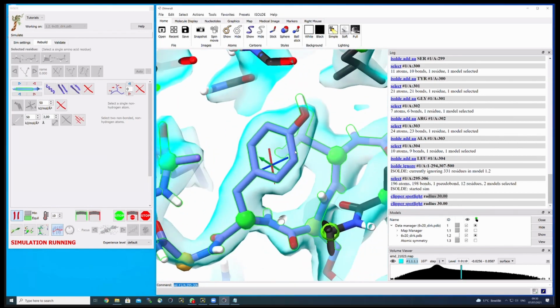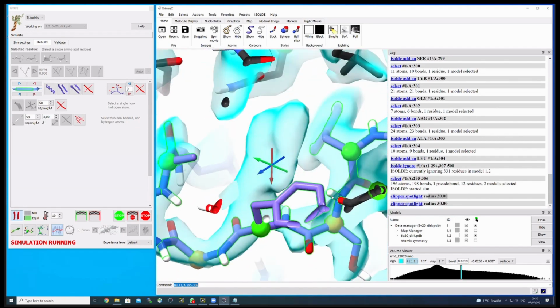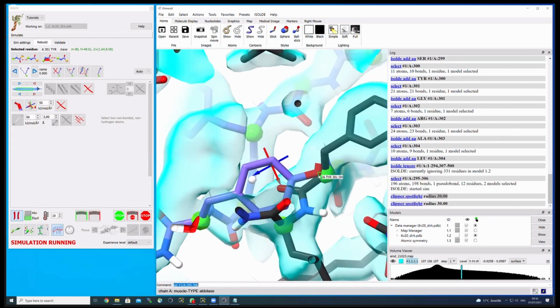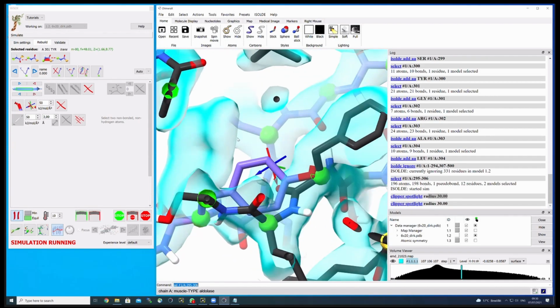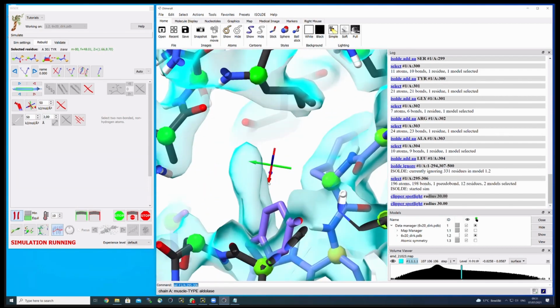and you click on this X here, and that will just remove these restraints. Another way of forcing atoms into a certain position, for example, is I move now this tyrosine out of its density, and I roughly know that this atom which I mark here now, which is the oxygen of this tyrosine residue, should be positioned at the tip of this tyrosine density. So what I can do is take this pivot here and move it to the position where I think this oxygen should be placed.